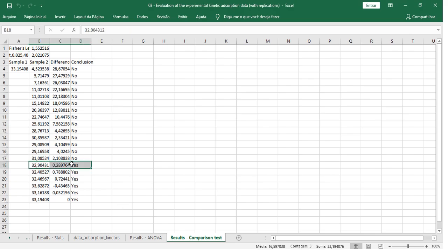The steps in the desorption kinetics and isotherms modules are similar to those presented in this video.